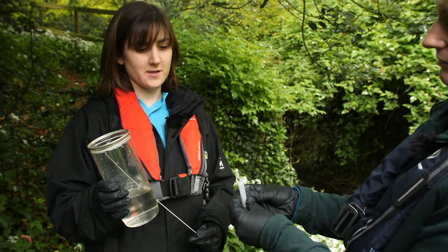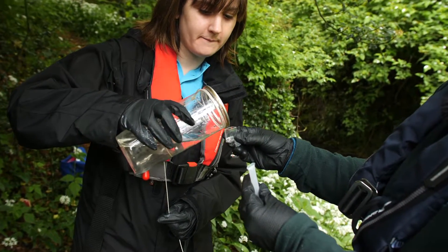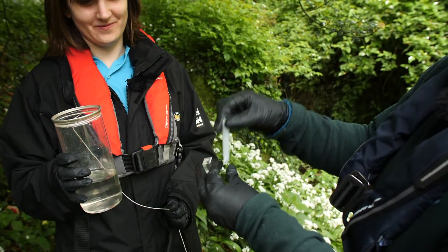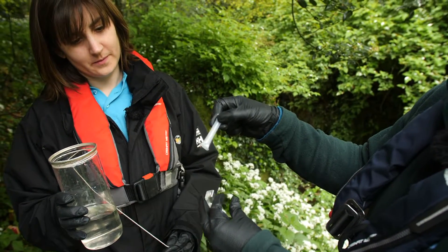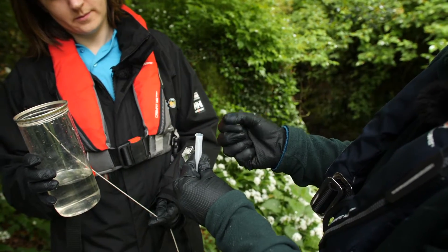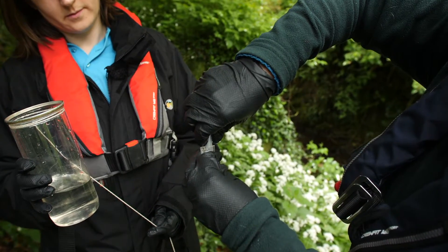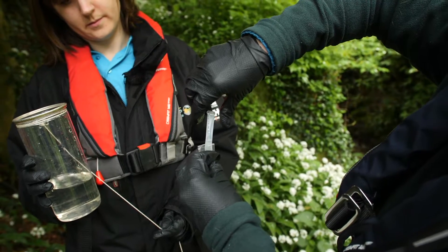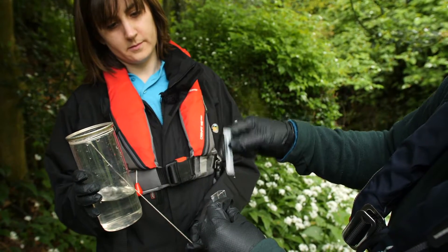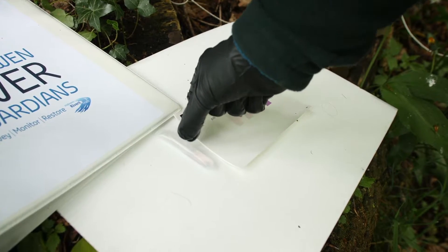Our next test is for phosphate, and this is a test you can do in the field. I'm just going to pour a little sample into this vial — that's why you need your gloves. This is the vial with a little bit of powder in it, so I pull out this pin. We'll leave this for five minutes now to see if we can get a reaction.